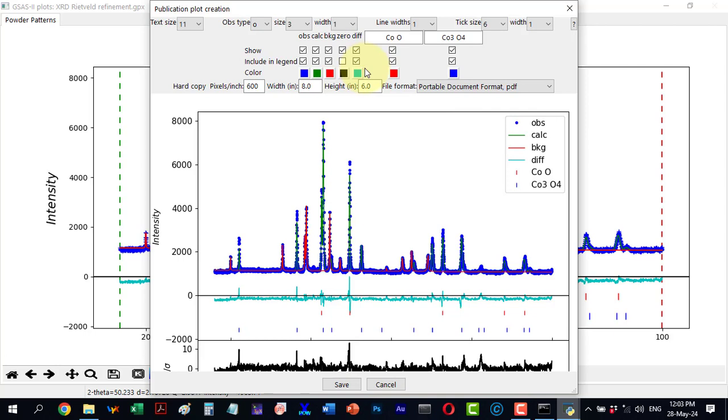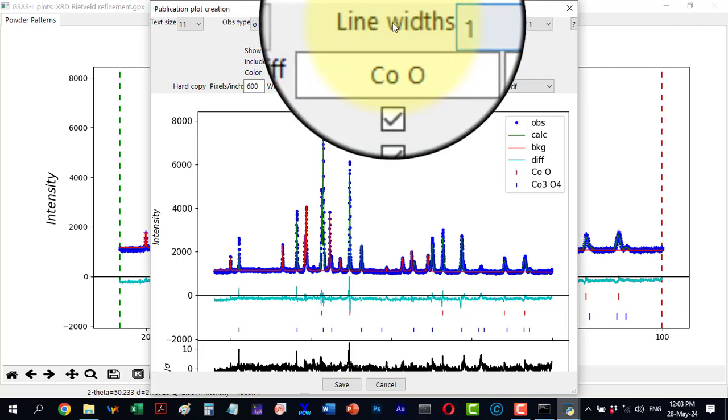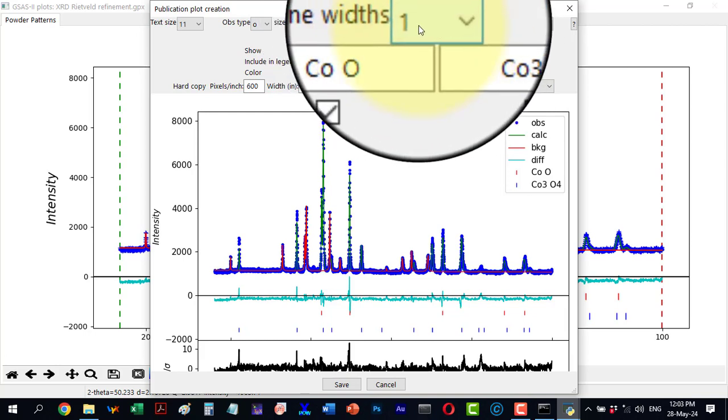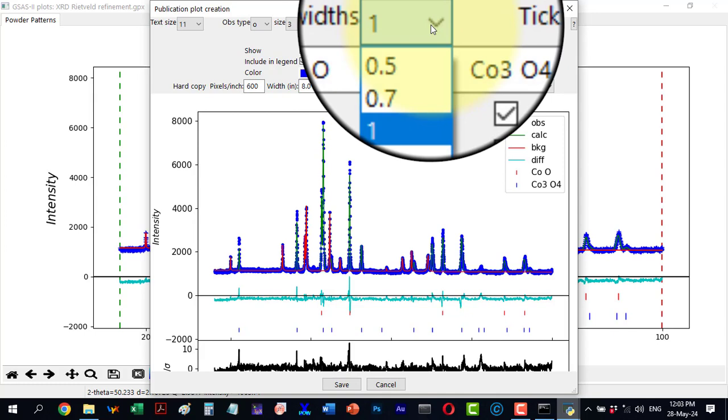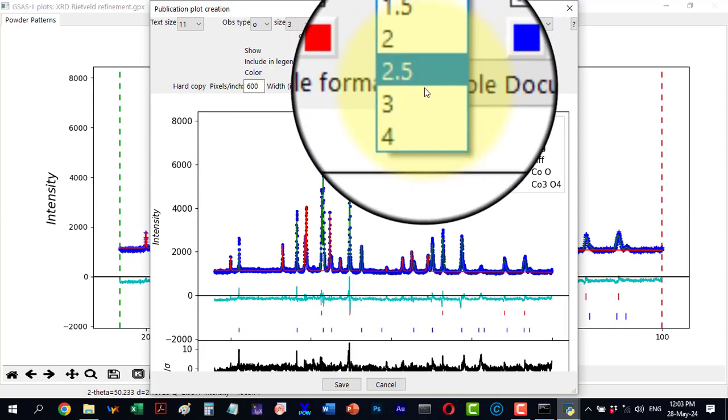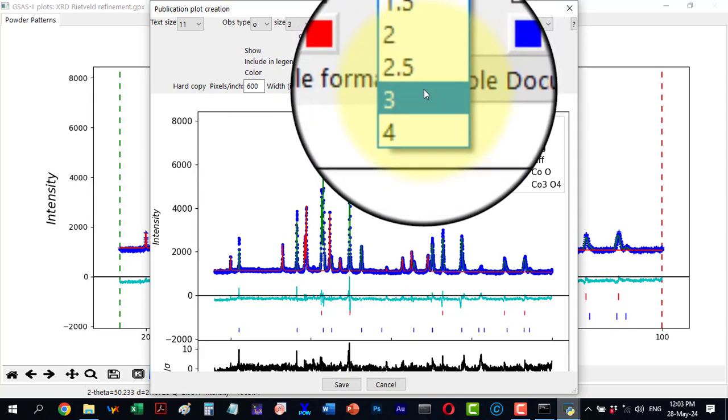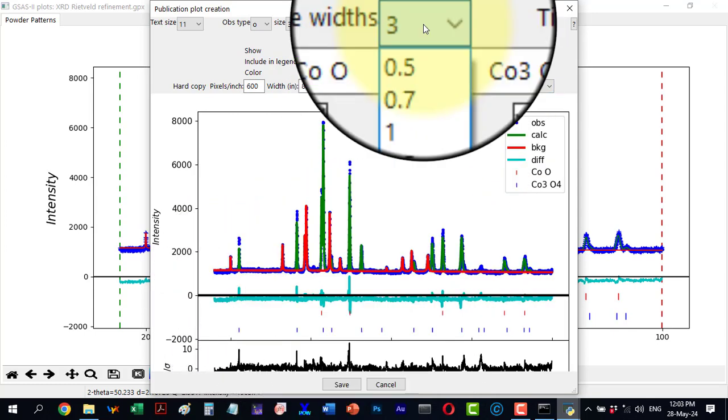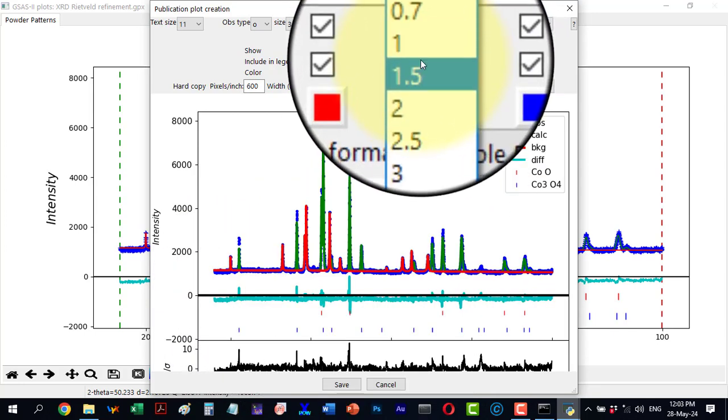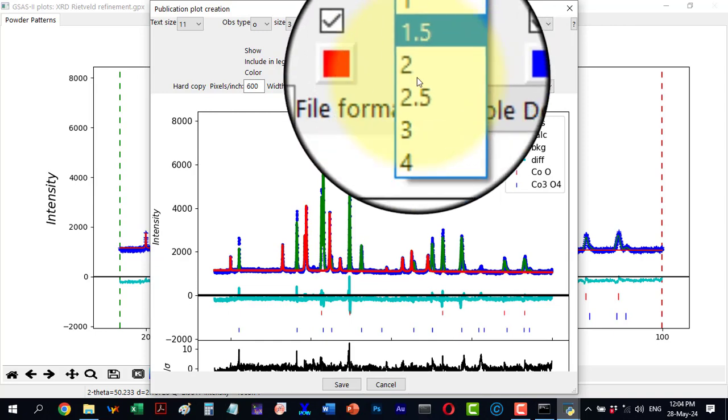The next parameter is line width which affects all lines in the plot, such as the calculated pattern, background, and difference. By default the line width is 1. If I change it to 3, all lines become thicker. I will revert to 1.5.